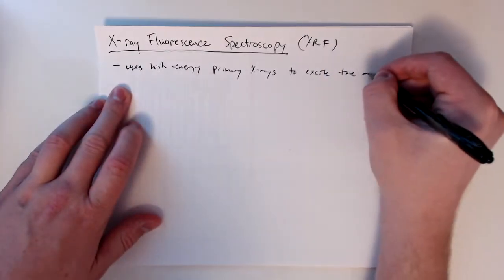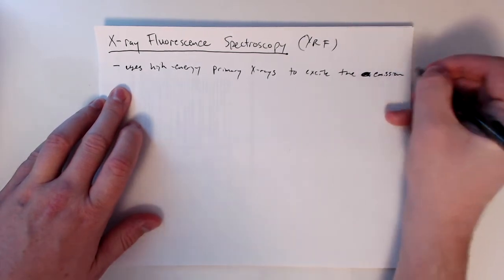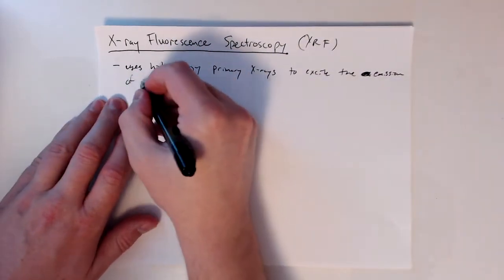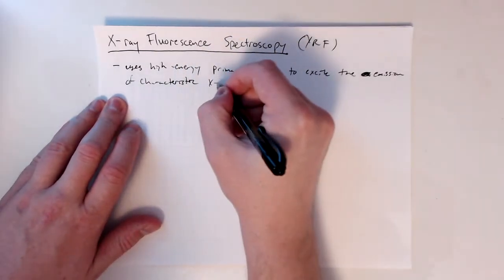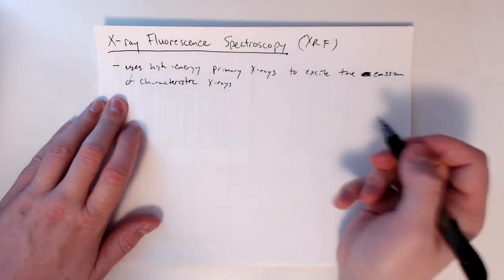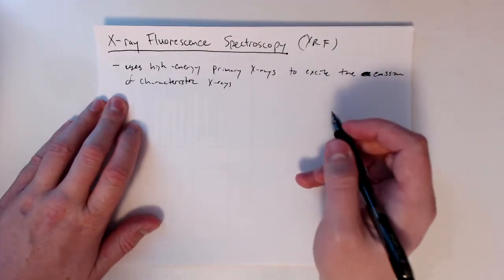And those X-rays excite the emission of characteristic X-rays. These characteristic X-rays, which we talked about last period, are what we're trying to excite.